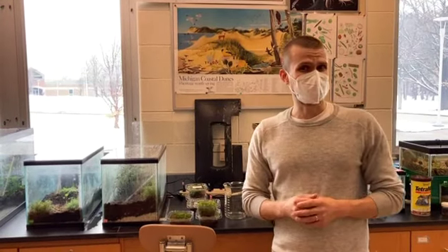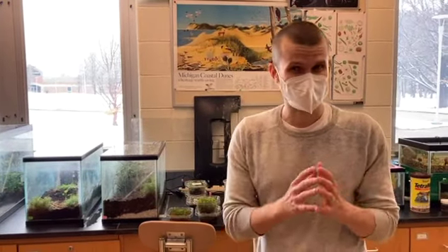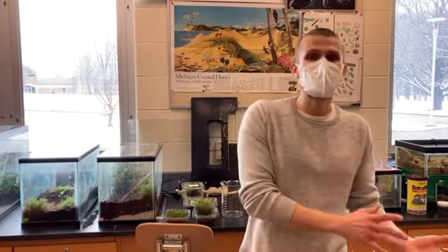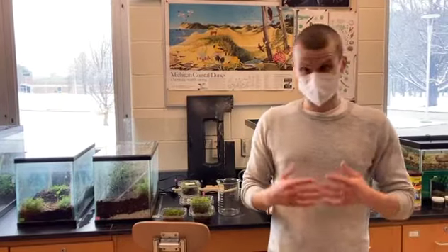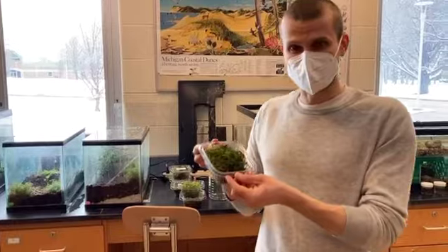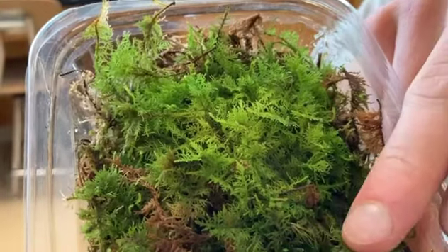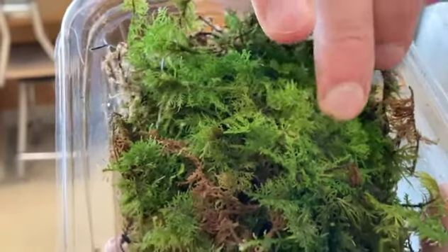So now that we're refreshed on our tree of life, we can now take a look at the very base of that tree of life for plants, which is very fitting because that's exactly where you find most of your bryophytes. These non-vascular, photosynthetic, gametophyte dominant plants are quite cute and quite tiny. So here what we're looking at is one of these gametophytes. You'll see that there is some branching, but if you take this under a microscope, you won't see any veins.